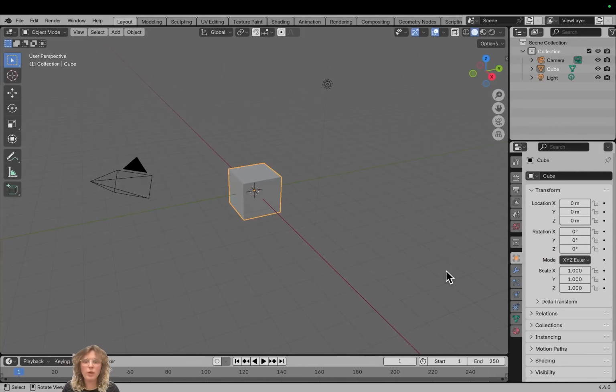In this video, we will load fluorescence data into Blender, which is a very powerful 3D rendering software, using the add-on Microscopy Nodes. So, for this, we'll first delete everything that is preloaded in our scene, the camera, cube, and light, by pressing A and then pressing X.